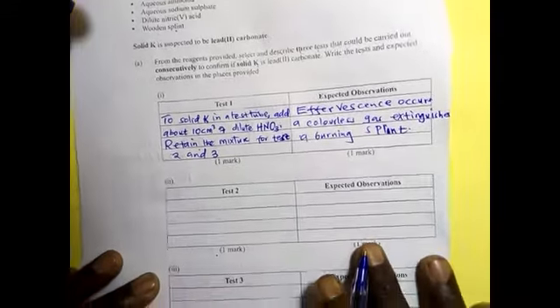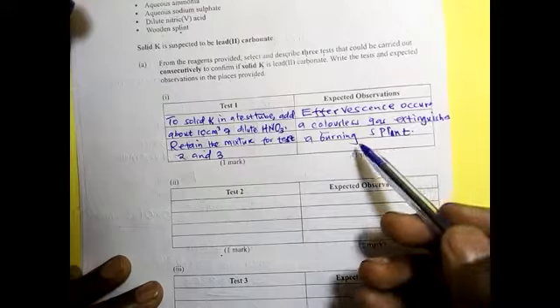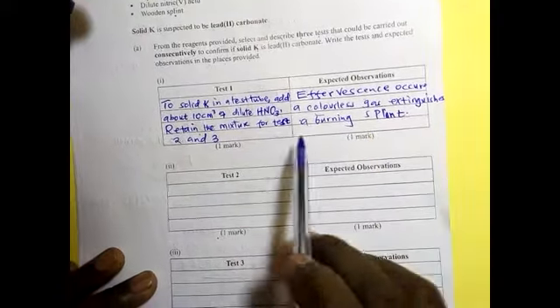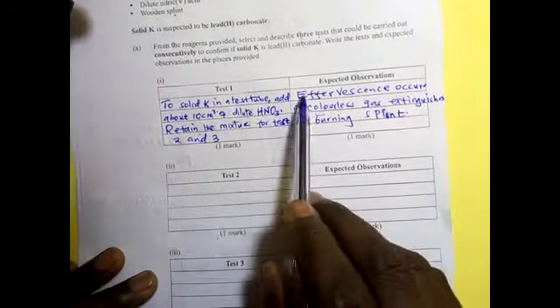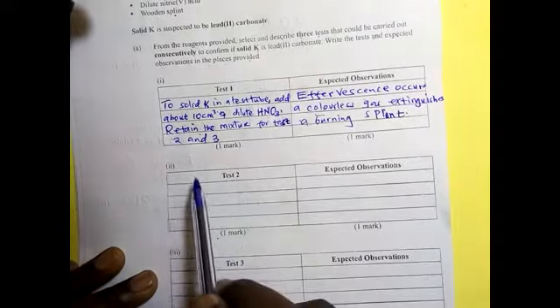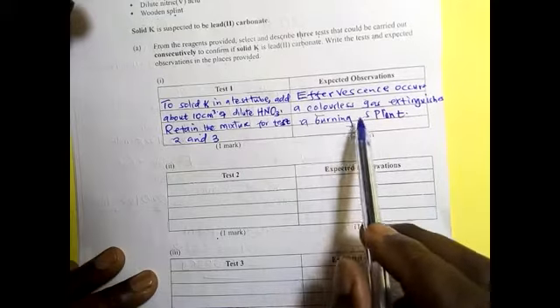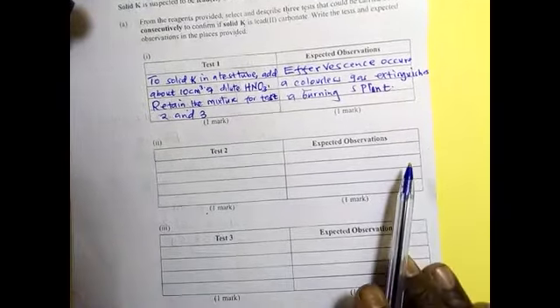Let us go to test number 2. These are the things we need to confirm: that this will produce effervescence, and effervescence is produced because of the carbon dioxide gas that will extinguish a burning splint when it is introduced to it.